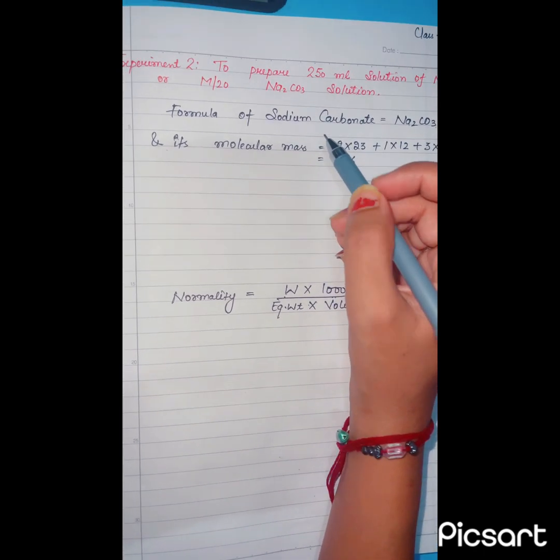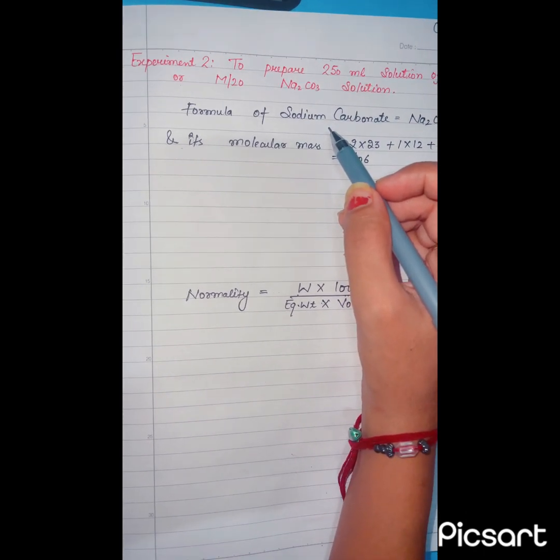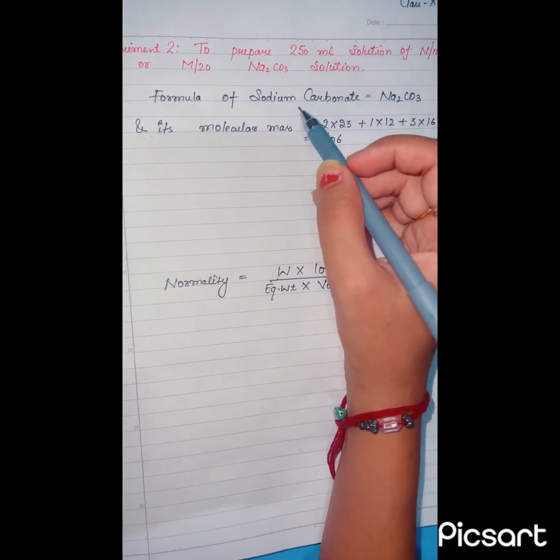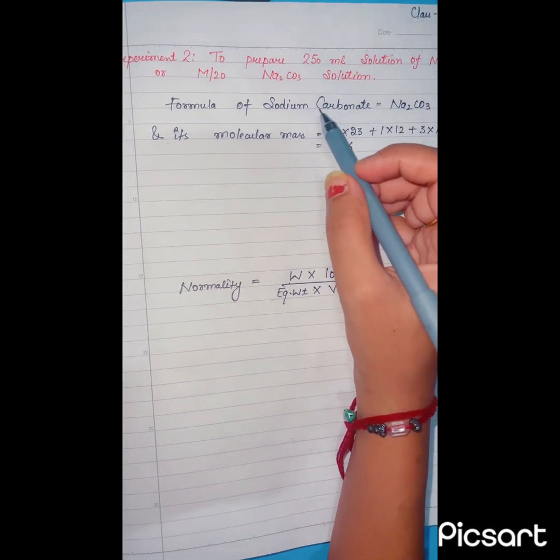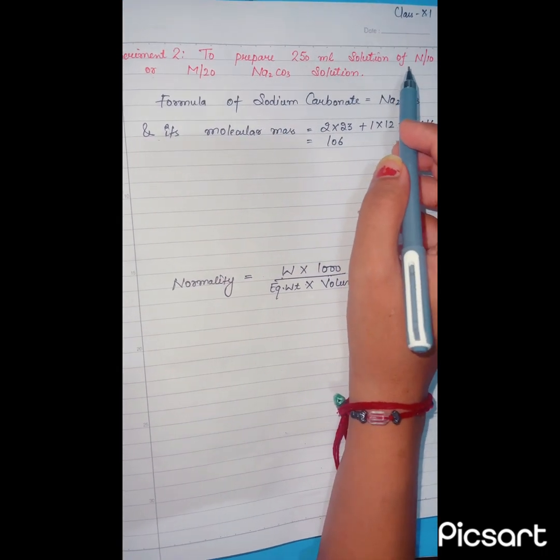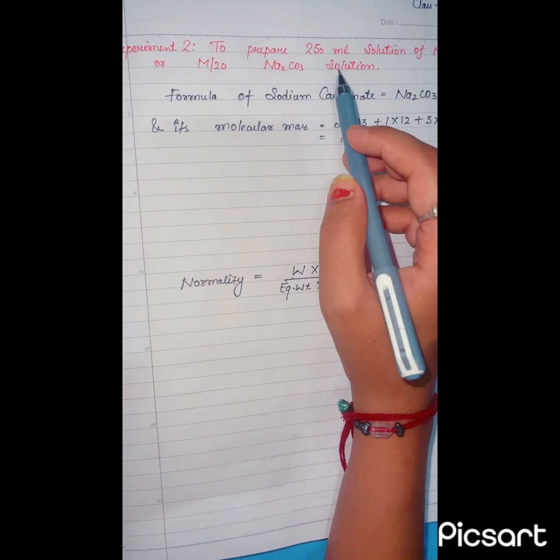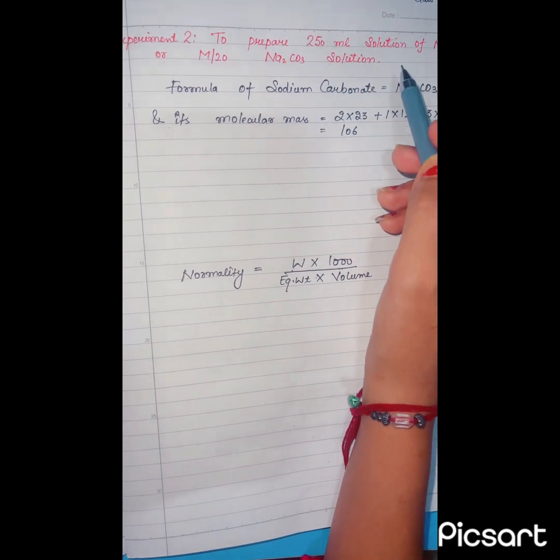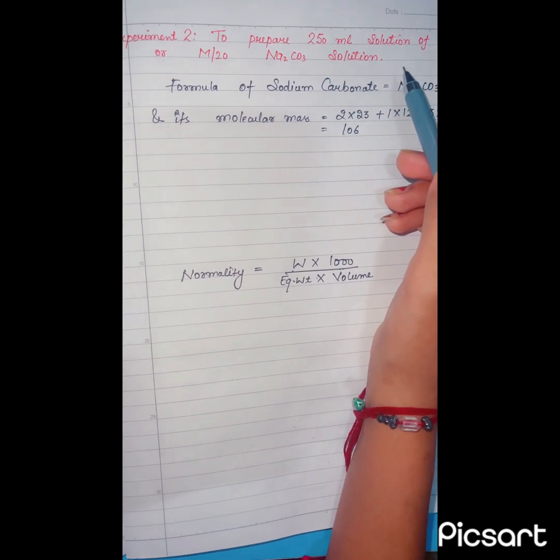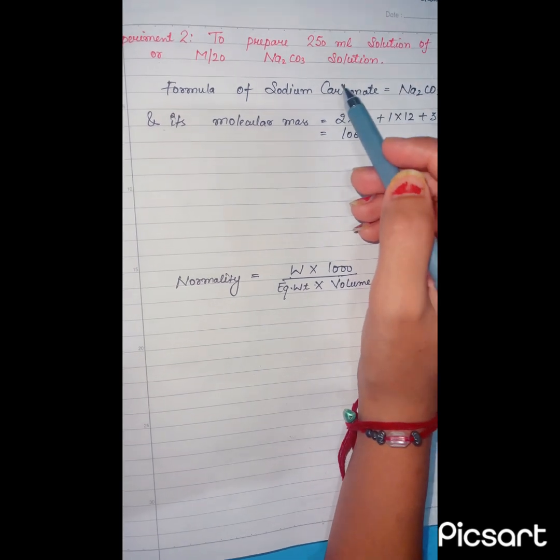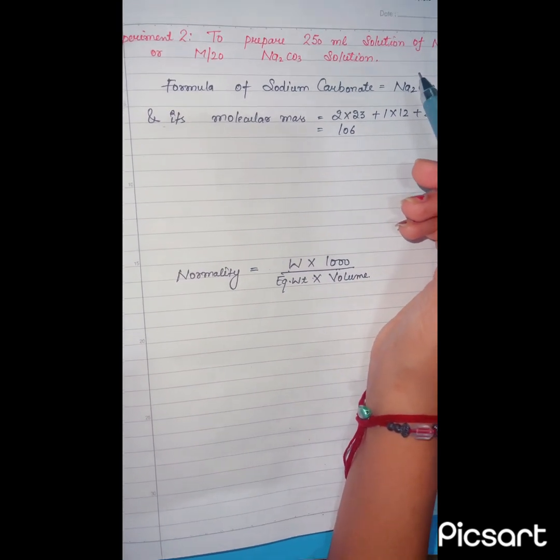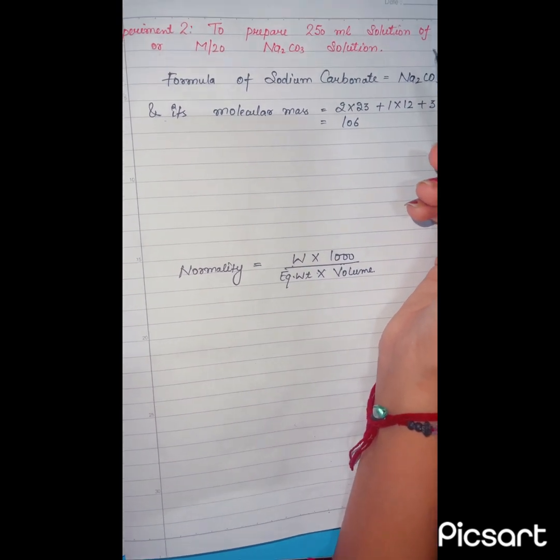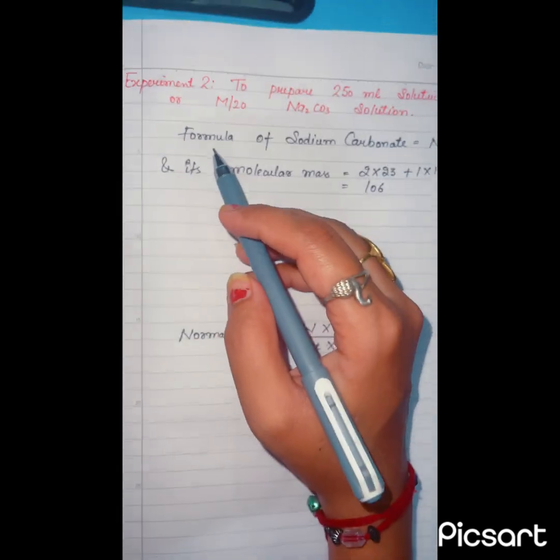Hello students, today we are performing the volumetric analysis class 11th experiment 2 to prepare the 250 ml solution of N by 10 or M by 20 Na2CO3 solution. It means N by 10 normality and M by 20 molarity sodium carbonate solution from the solid crystals of sodium carbonate.